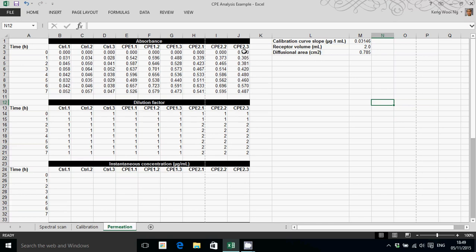In this video, we're going to explore how to analyze permeation data from Franz diffusion cell experiments. Once you've collected your absorbance data from your experiments, you would enter them into these spreadsheets.